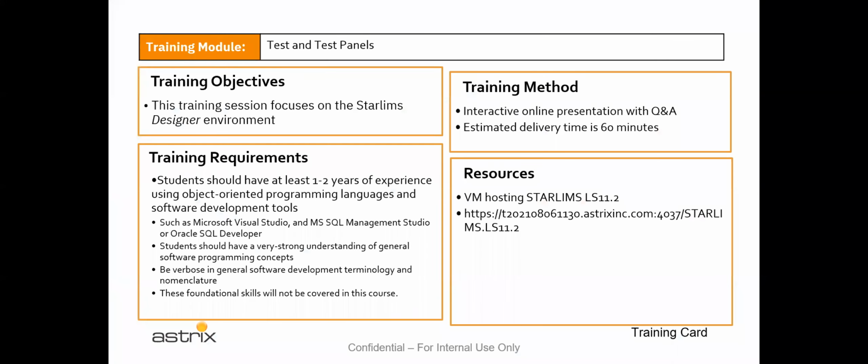So these are the training objectives. Everybody here is very well qualified to use the system. And this is going to be about, I'd say, close to an hour maybe by the time we're all done with this.